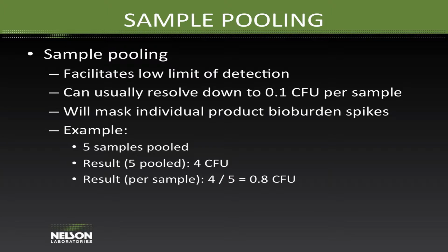Okay, so I'm going to go a little more in depth in a few of these. Sample pooling is a great option for a manufacturer, because instead of testing 10 samples in individual tests, you're putting them all into one test. So financially, that sounds great. You're only paying for one bioburden test rather than 10.